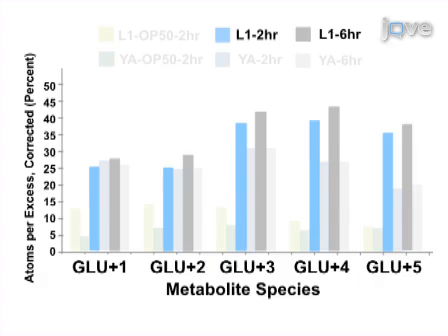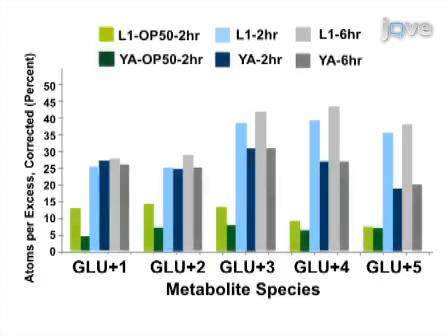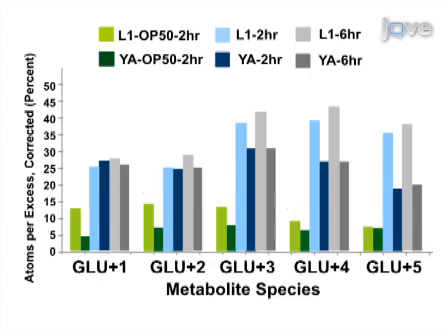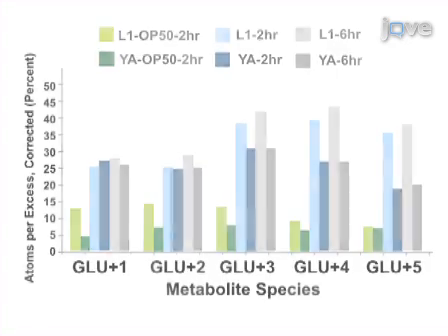In both isotopic exposure courses, less isotopic enrichment was observed in intermediary metabolites when animals were cleared by feeding unlabeled bacteria for 2 hours. Therefore, the optimal clearing protocol for worms grown on bacterial spread NGM plates with isotope was determined to be clearing for 2 hours on unspread NGM plates.